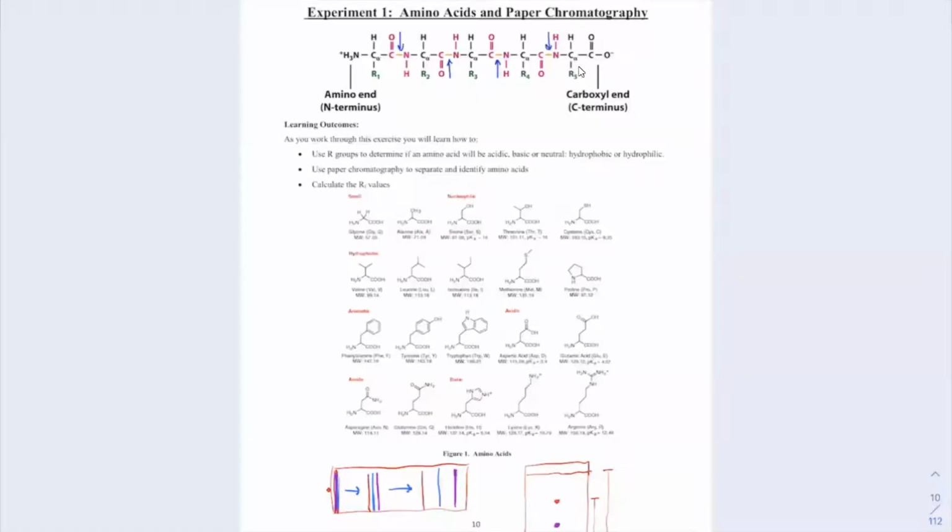Hello there. I'm Dr. Andrew Pantalano, and today I'm going to be discussing with you our first biochemistry experiment, amino acids and paper chromatography. So we're going to be discussing amino acids, which are very critical components in all organisms.